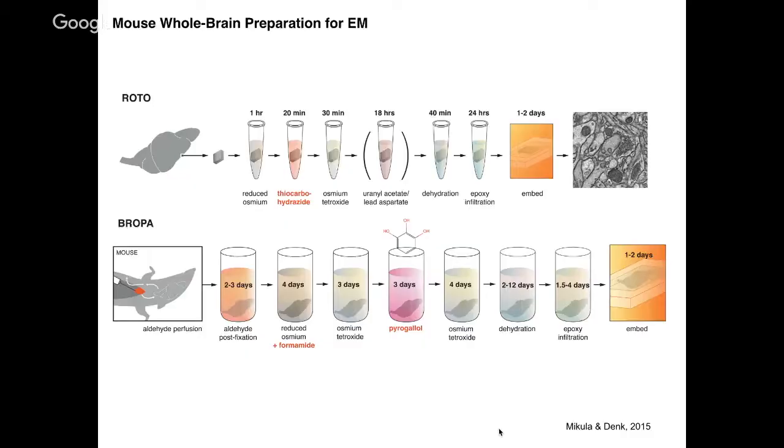This parameter space included different things that you would add to the solution in order to expect enhanced penetration. So this would include detergents, solvents, various different ions. Different things were looked at in buffers. And after this screen, I found out that formamide was the missing ingredient. And what's interesting is, formamide is a very small molecule. And if you look at variations on the formamide molecule, like acetamide, which has the addition of just a single carbon, it does not enhance penetration at all. And so there's something very peculiar about formamide.